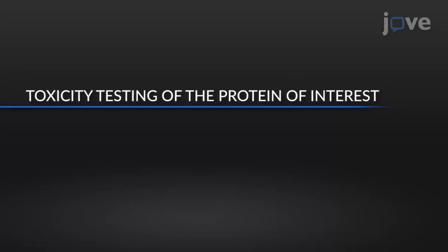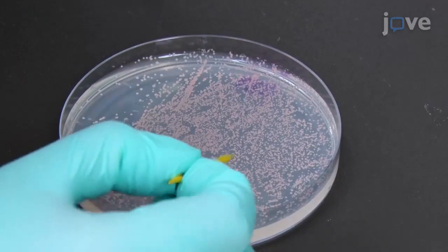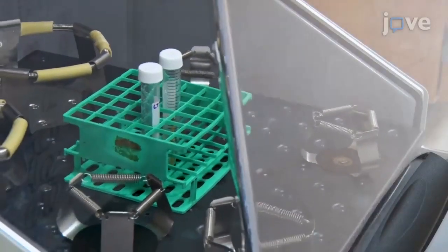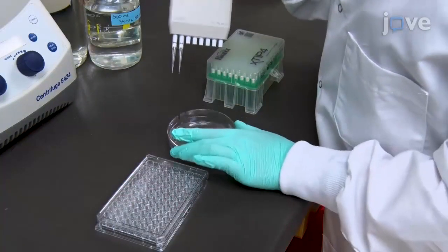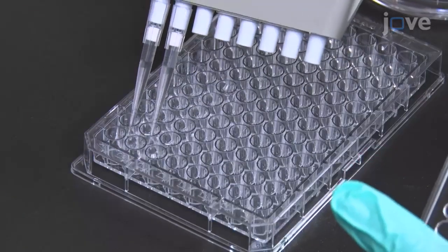Begin by inoculating 5 milliliters of single dropout broth with a single colony of yeast transformed with the effector protein containing plasmid. Use yeast transformed with the vector alone as a negative control and incubate the inoculum overnight at 30 degrees Celsius while shaking. On the next day, add 180 microliters of sterile water to the A2 through A6 wells of a 96 well plate.